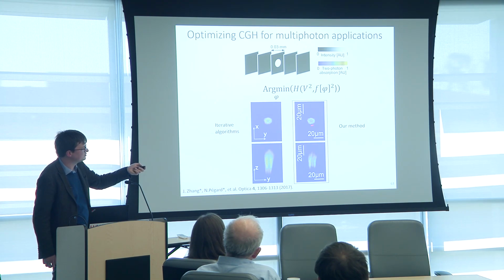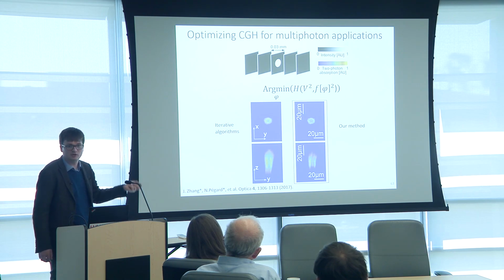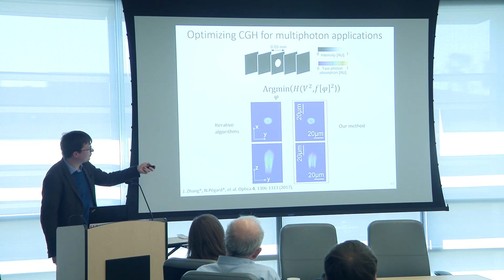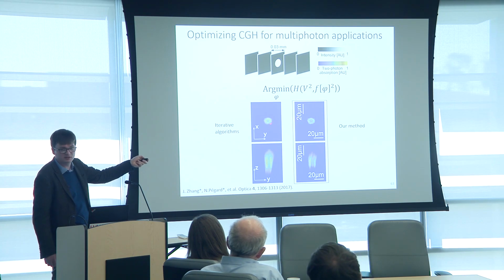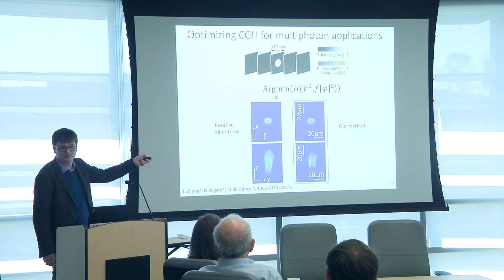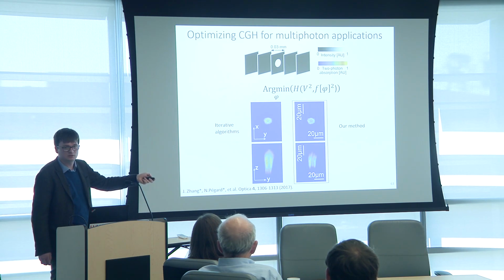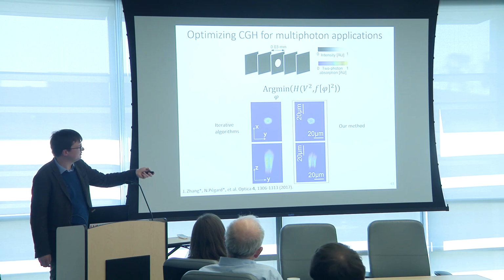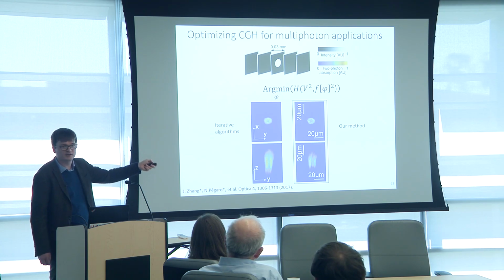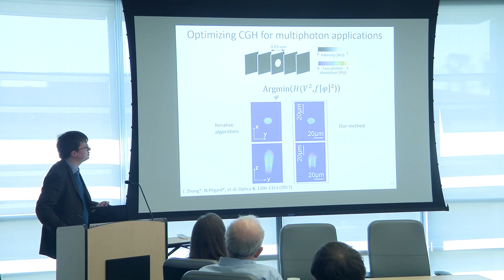This becomes more of a speckled disk. But for that, you get enhanced confinement along the z-axis. This hologram looks uglier than this hologram. So if you give that top image to an imaging specialist, they'd say, I prefer this. But if you give the top and bottom images to a neuroscientist, they will prefer this more confined excitation spot. So by tailoring the cost function, you can do better biology.